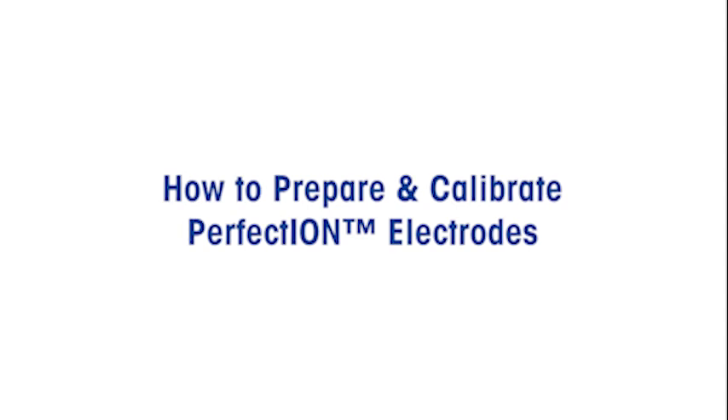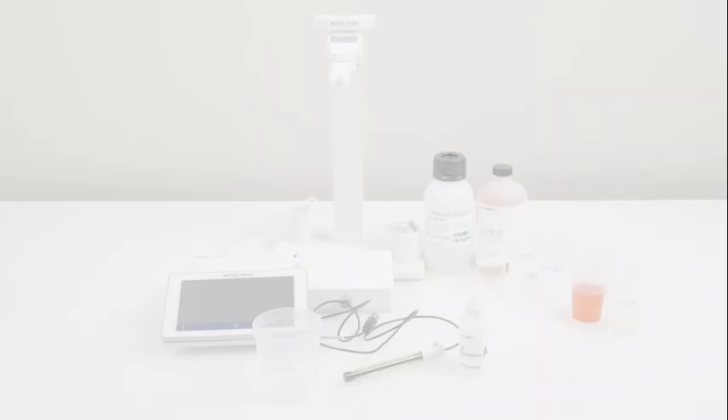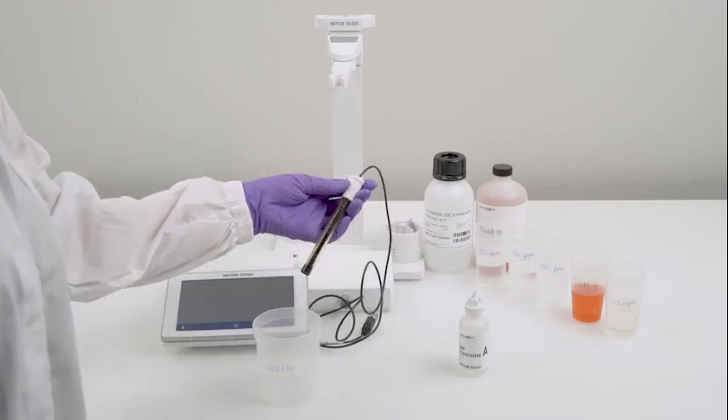Welcome to the step-by-step guide on how to prepare and calibrate the perfect ion electrodes. To get started, we need to place the perfect ion electrodes in a diluted ion solution without ISA for 24 hours.